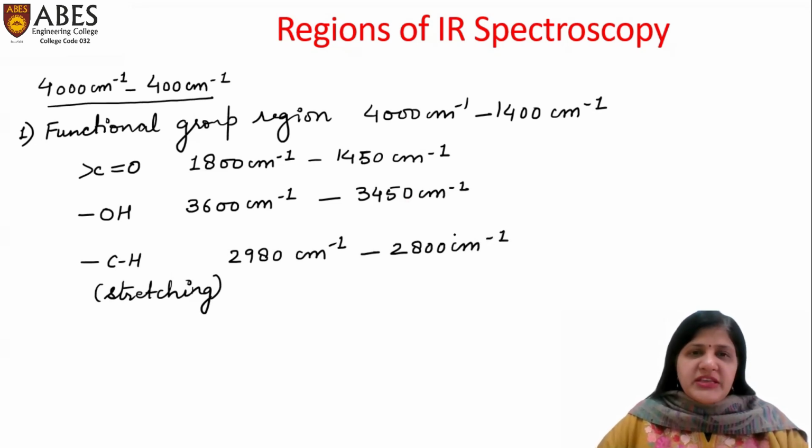So these are some basic functional groups which have their particular vibration frequency, and presence of any such band in the spectrum corresponds to the presence of these functional groups in the molecule.